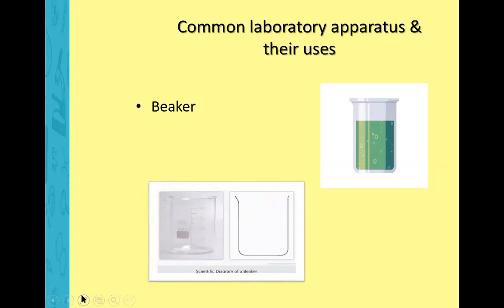Means if you require a very small amount of a chemical to heat or collect, we can use a 25 ml beaker or 10 ml as well, or then we have large sizes of beaker. And you can see this measuring sign that shows what volume you are taking. This sign is present on all the beakers for your convenience.